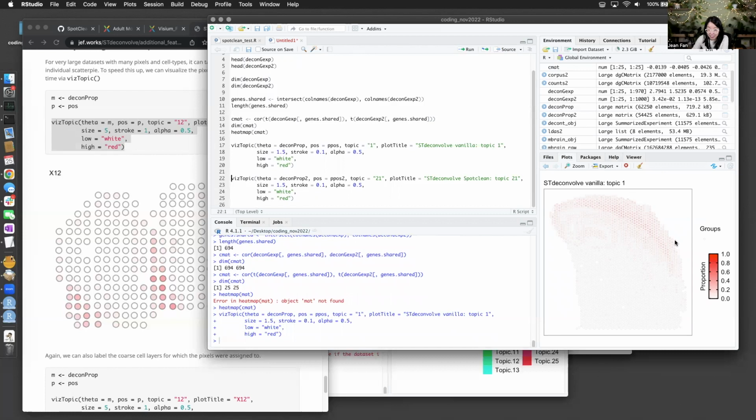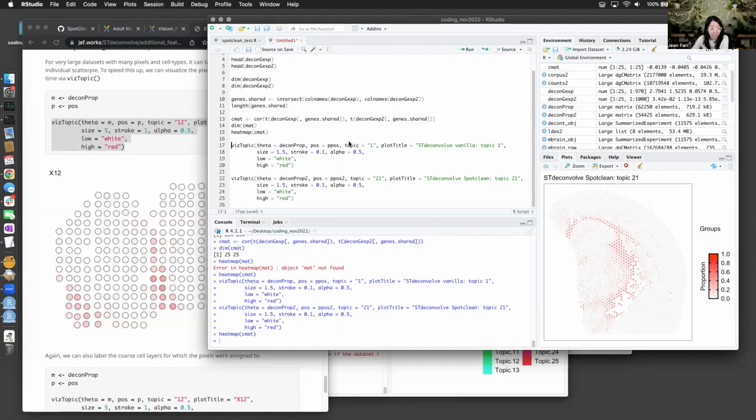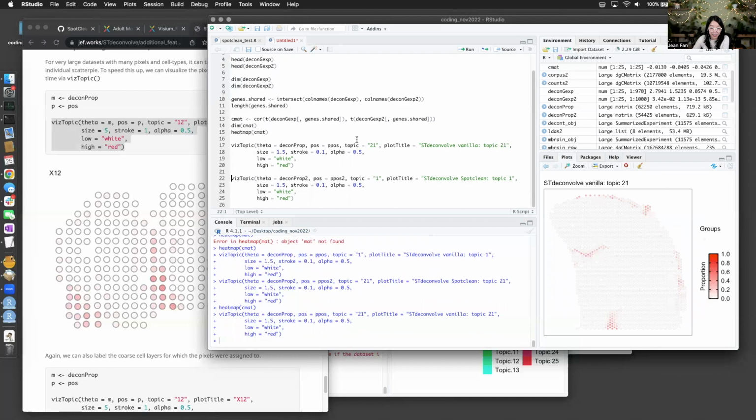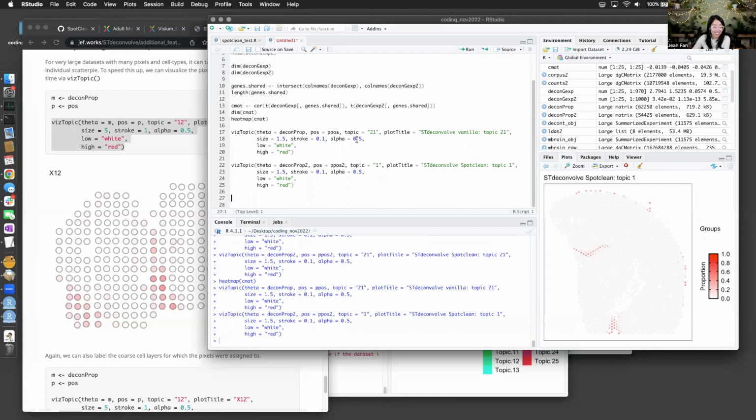Okay, yeah, so we see some layer structures and okay, that's definitely not right. Did I swap the two? I always forget which corresponds to the row and which corresponds to the column. Okay, maybe it's the other way around. Let's see. It's the other way around. Hooray, it's the other way around. Okay. Good debugging.